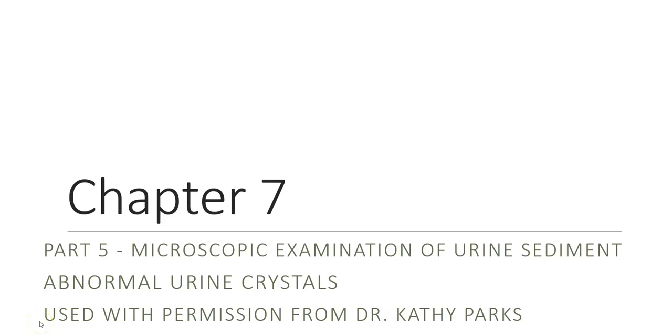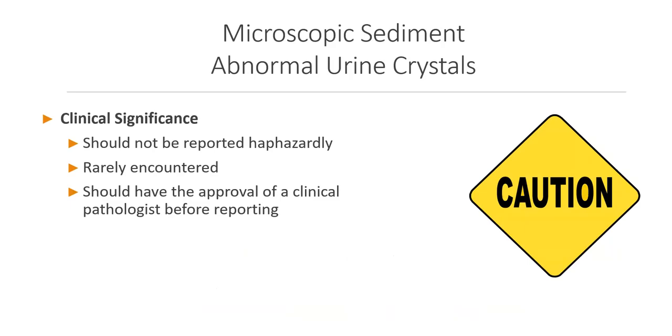In this part of Chapter 7, we're going to discuss abnormal urine crystals. This is used with permission from Dr. Kathy Parks. In discussing abnormal urine crystals, these are always clinically significant, and you should not report them haphazardly. Abnormal crystals are rarely encountered, and they should be reviewed by the supervisor and/or the pathologist for confirmation before reporting out.